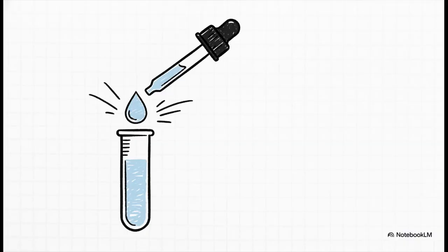Moving right along to phase 2, the catalyst, introducing a variable. And enter ingredient number 2, potassium iodide solution. Just think about the sheer narrative anticipation building here in just a handful of words. On one hand, you've got the lead nitrate just sitting there, waiting patiently in the test tube, and on the other hand, you're now instructed to hold this potassium iodide solution. These are 2 completely distinct elements, right? They're totally separate and perfectly stable on their own. But the instructions are building up to a climax. They are about to force these 2 completely distinct worlds to collide.